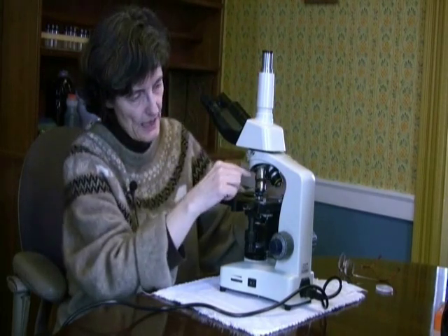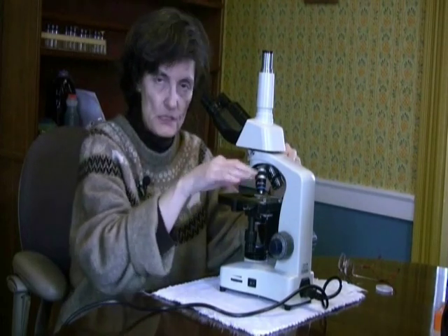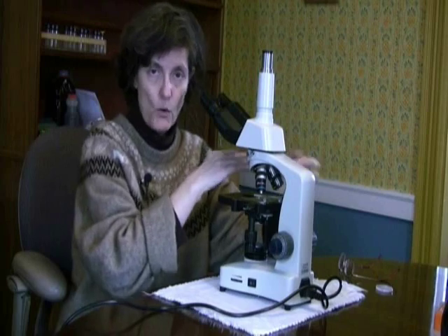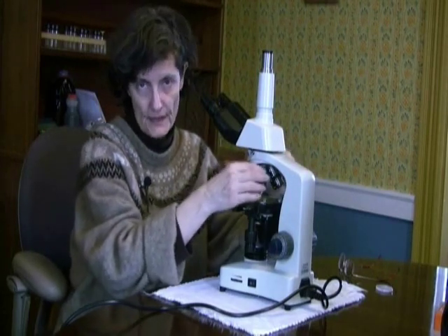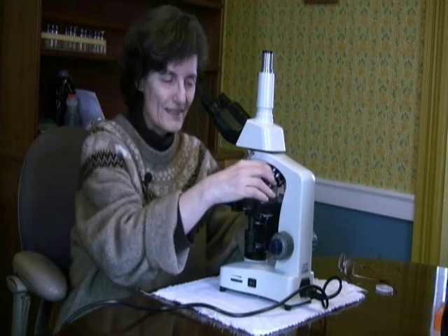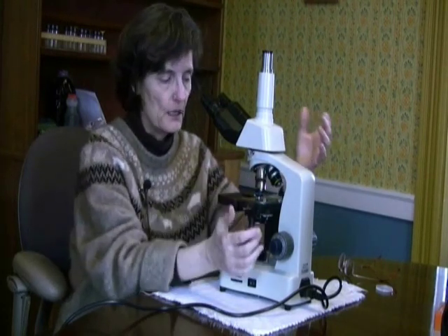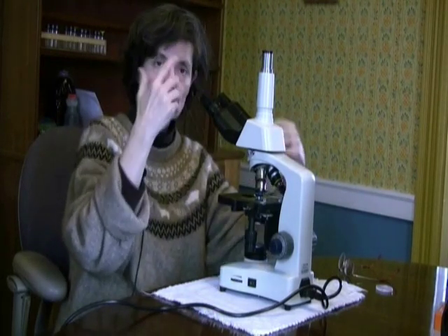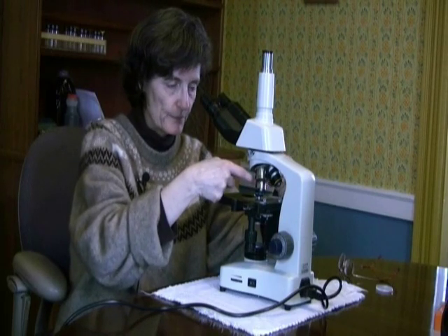The next thing you need to have is at least a 4x lens, a scanning lens, so you can see things at pretty low magnification. You need a 10 or 20x objective, and then a 40x objective. All of the quantitative work that we do will be done at this 40x objective. Of course, 40x objective, 10x eyepieces, total magnification of 400.